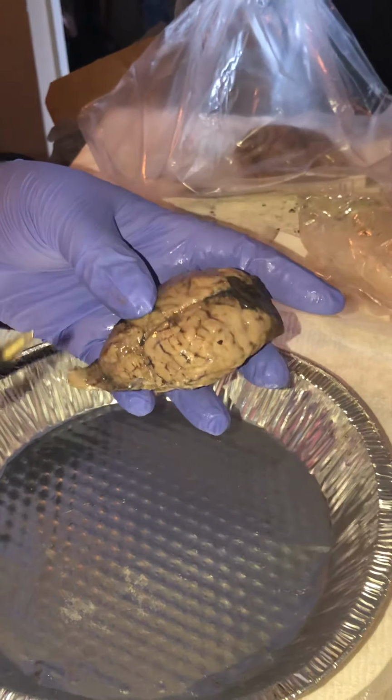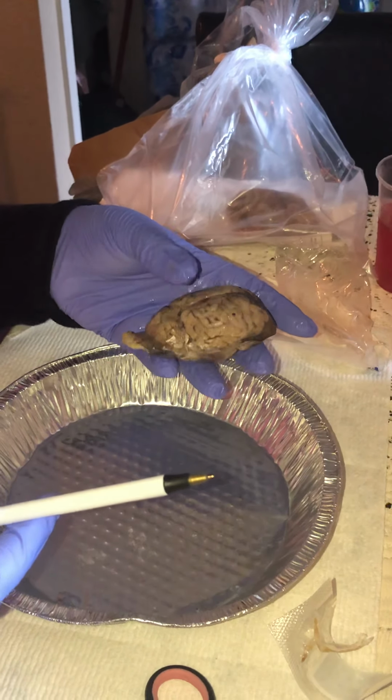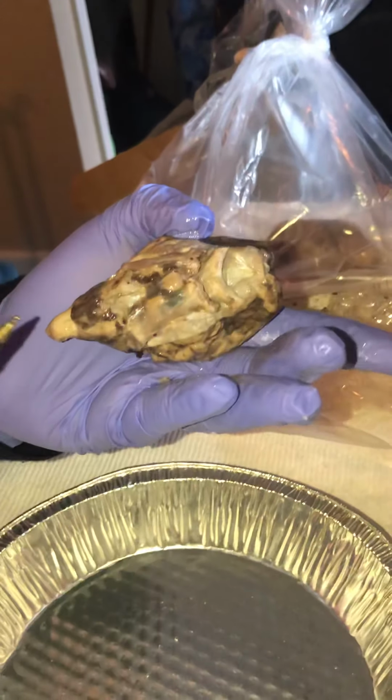But before we get into that, let's just do the stem really fast because I have all this memorized.